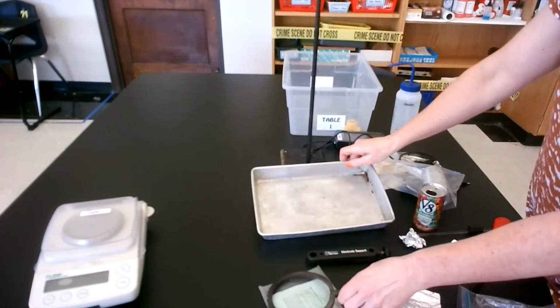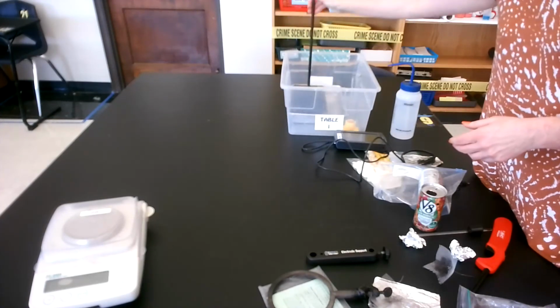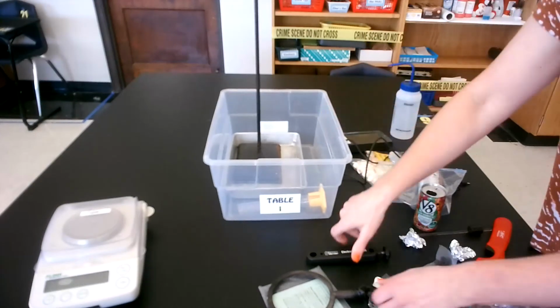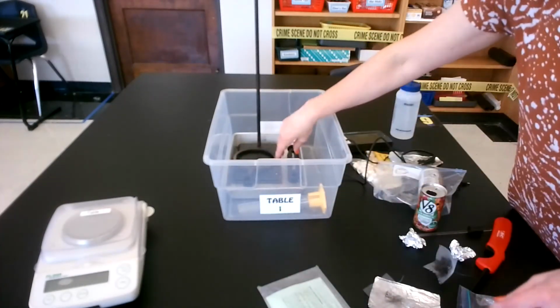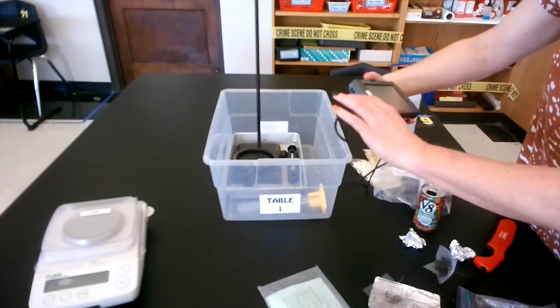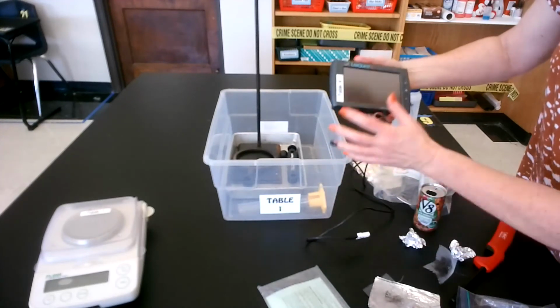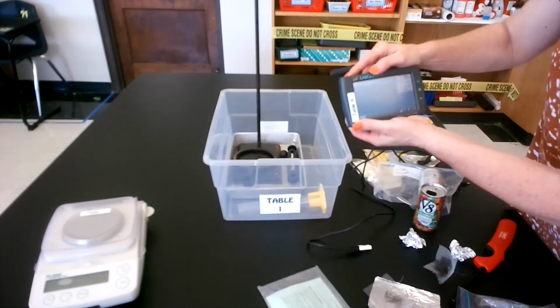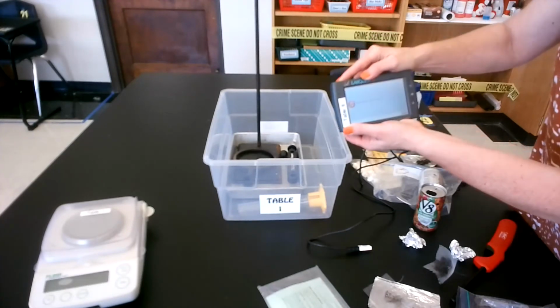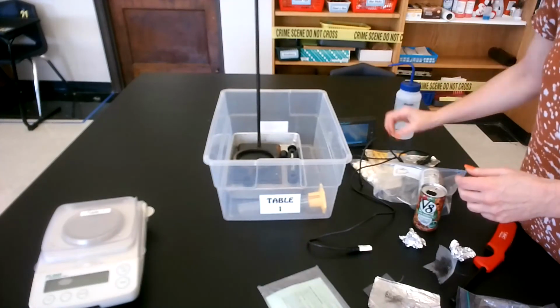The most important thing is that this tray goes in first, and then the ring stand, because those are the heaviest items. And then you can start putting heavy items in first. You're going to disconnect the Quest, pinching that white, so carefully, don't just start pulling on it. Make sure this is turned off, and it'll ask if you want to store. So you may have to hold it until it goes dark. There we go. It takes a little bit of time. It'll shut down in so many seconds. Let that do its thing.